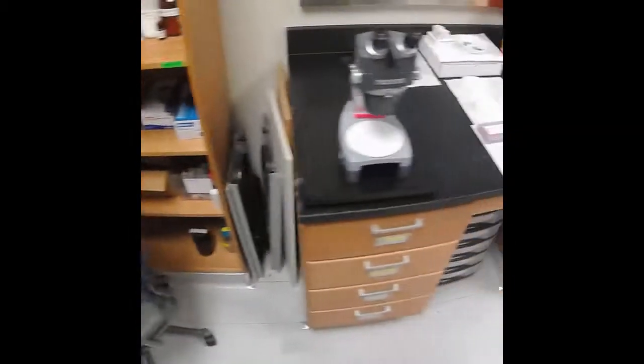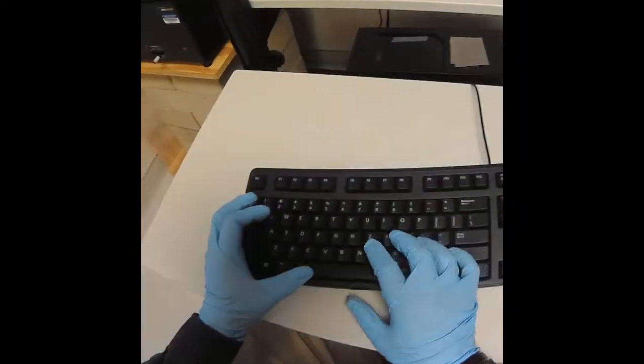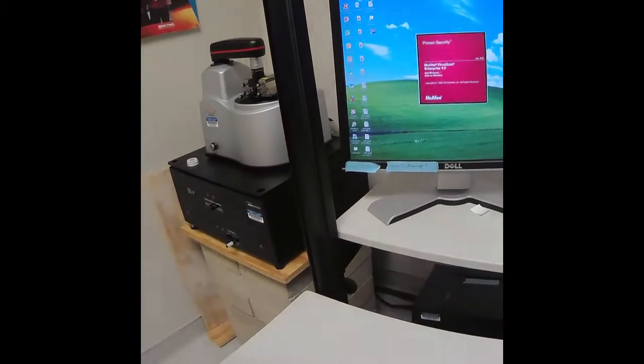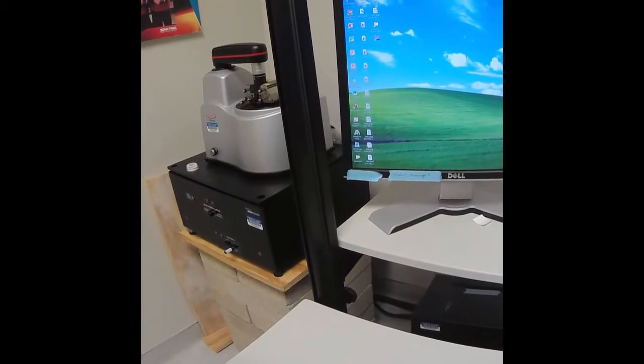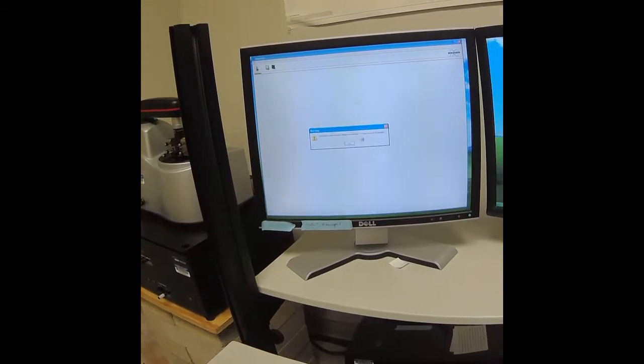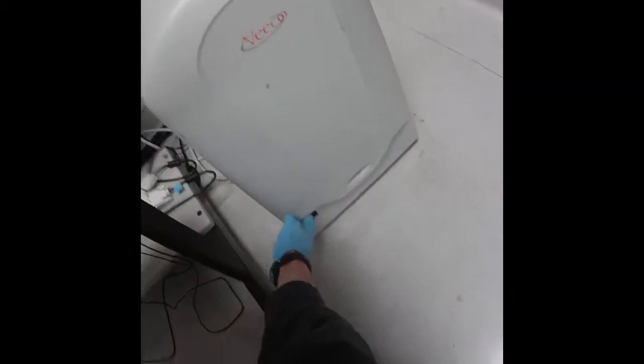On the computer, log in using the credentials on the screen. The software we want to use is called NanoDrive. When that opens up, it's going to tell you that the controller needs to be on. The controller has a power switch right there and a green light. You can see the green light is not on. We have not turned it on yet. So we'll turn it on.